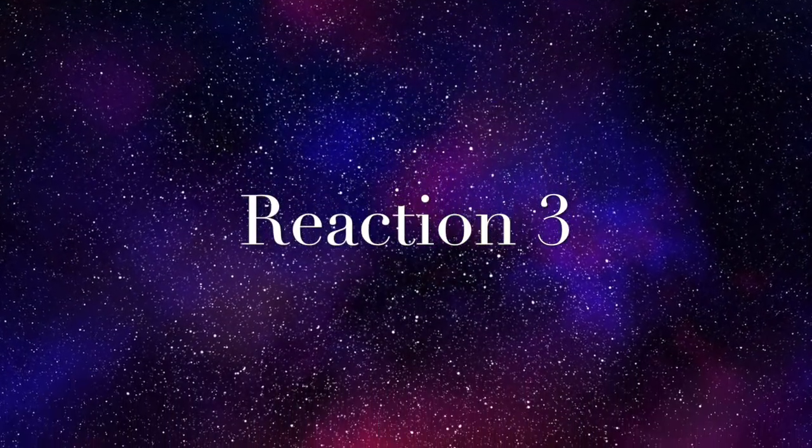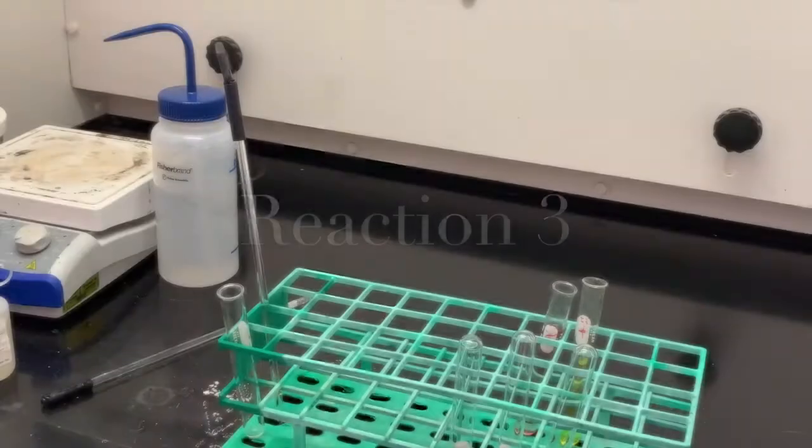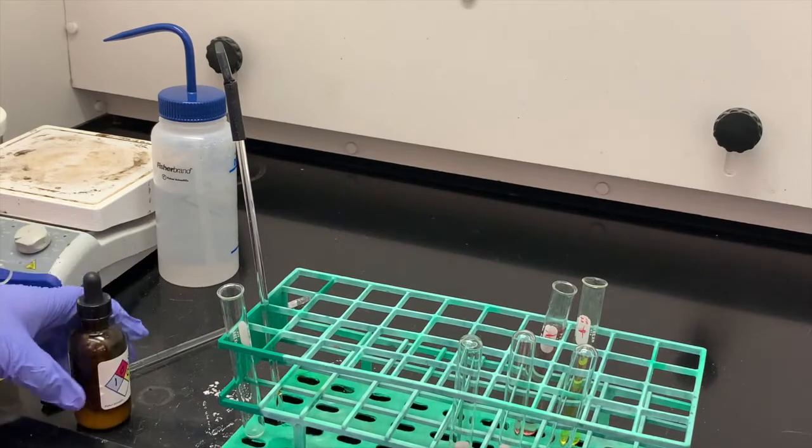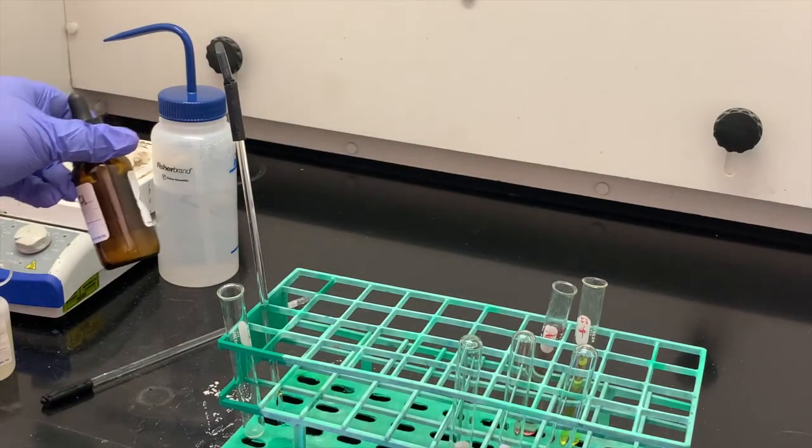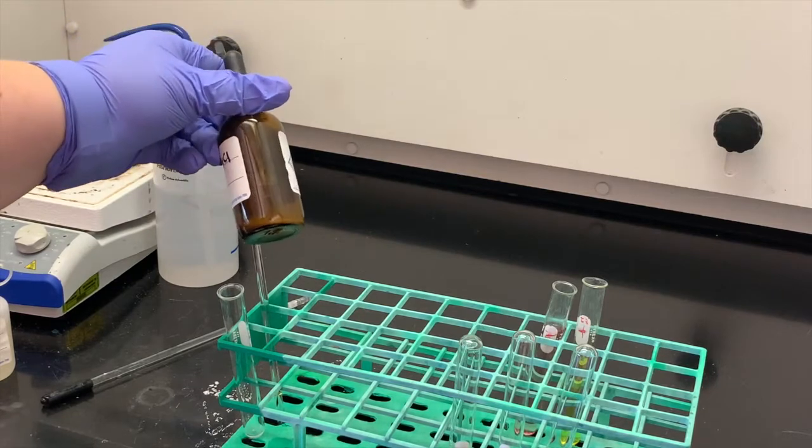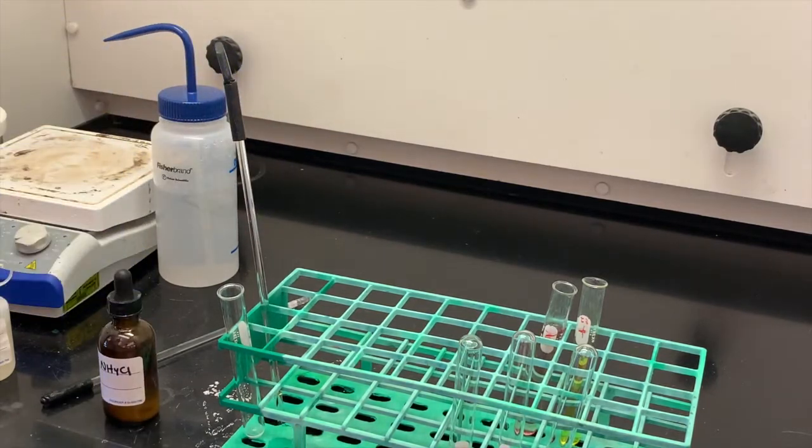Okay, so we're going to start out with a solution of saturated ammonium chloride. I have my saturated ammonium chloride in this little bottle here. At the bottom you can tell that there is some solid at the bottom, so that's how we know that it is a saturated solution. But for the reaction, we only want to get the solution part.